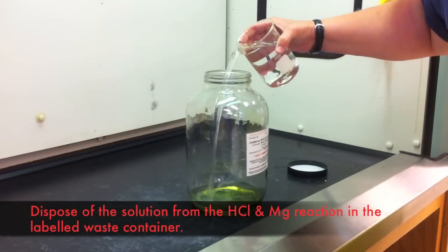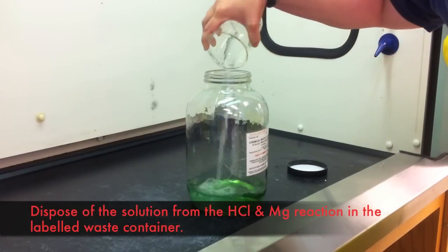When you are done with this experiment, dispose of any solution that contains acid in the labeled acid waste container.